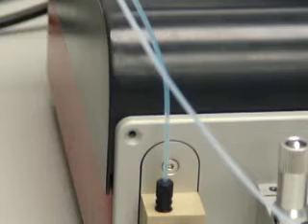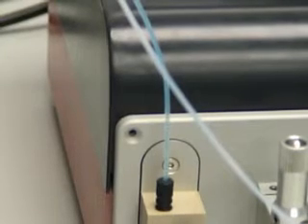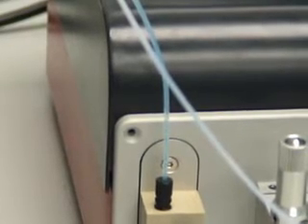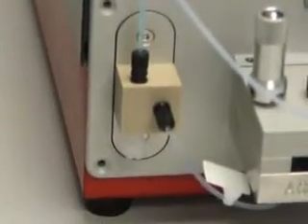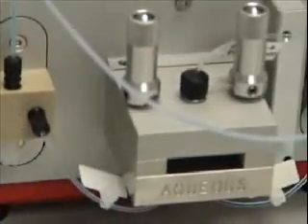Here you can see a series of bubbles of the aqueous dye within the acetate flow as they leave the microreactor. These pass into the FLEX, where they're separated using a membrane. Users can control both the overall back pressure and the cross membrane pressure to change the separation potential.